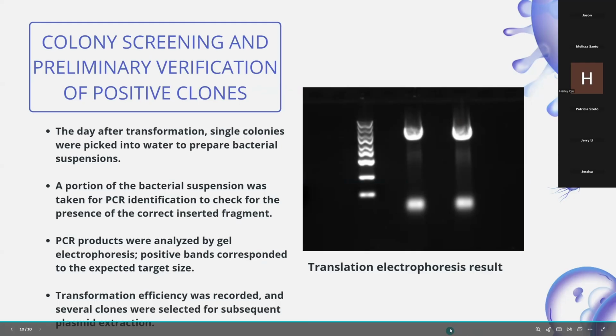Just quickly as a closing, now we need to work on the transformation into yeast for expression, but I didn't have time for it, so I didn't do that. We don't have much left, though. All we need to do is check whether the enzyme actually works. Since we already have the DNA in hand, we just need to check with the company whether all the coding sequences are aligned and whether it's possible to put it into yeast.